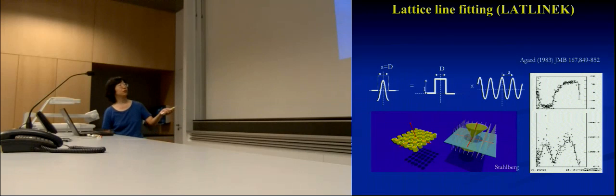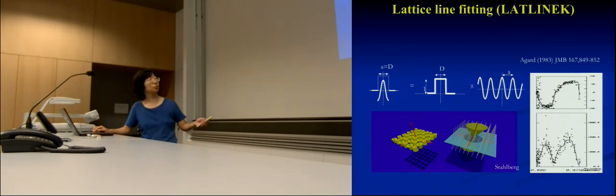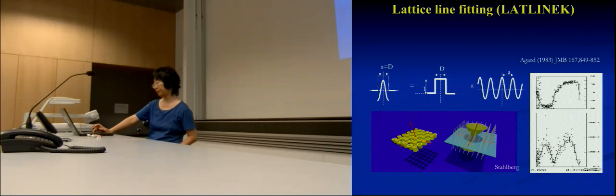So that's represented here. In the 3rd dimension, if we consider the original form of the function is a sinusoidal form with a period of a, and if you apply an envelope to it, so that it's restricted to just one of those, then that's what we get in a lattice form, lattice line. Normally, when you see this, it's going to be represented in a complex form as a vector with amplitude and phase. So usually you have amplitude and then phase shown.